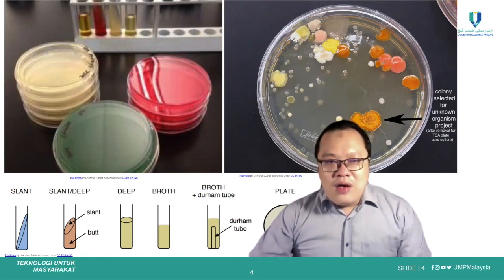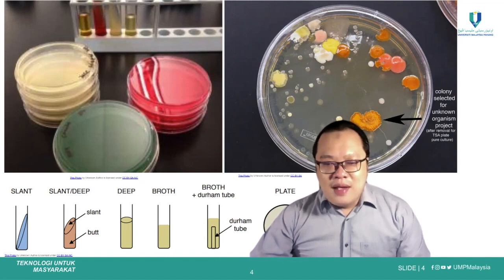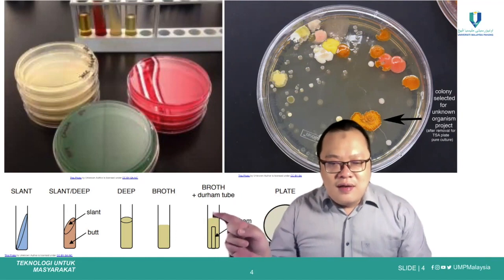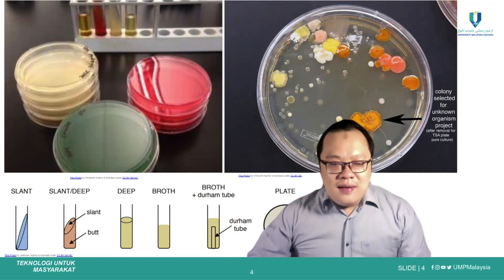There are a variety of media being prepared in the microbiology lab. As you can see from the figure over here, there are slant or deep, and then deep agar.